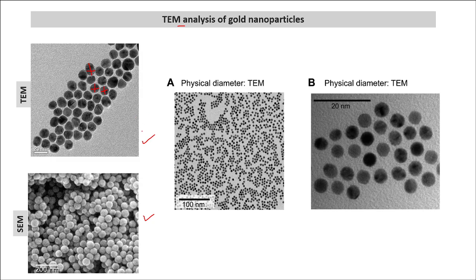So both these techniques have their pros and cons. Whenever you are publishing a paper or proposing that you have made certain kinds of nanoparticles, in order to make your data more impactful, you can do both analyses, scanning electron microscopy and transmission electron microscopy, to better validate your data.